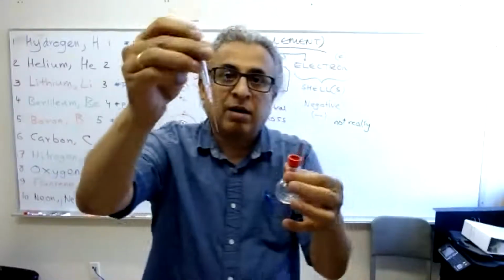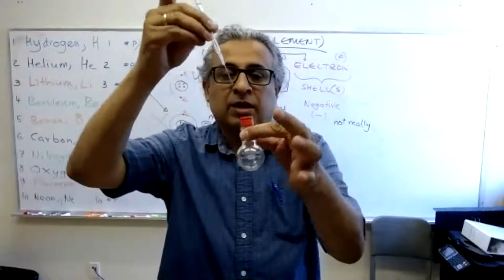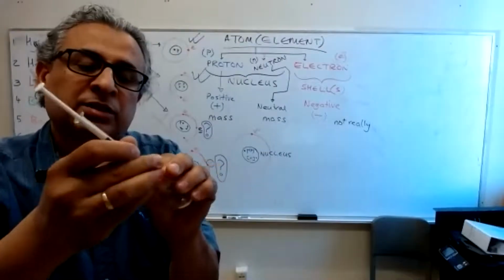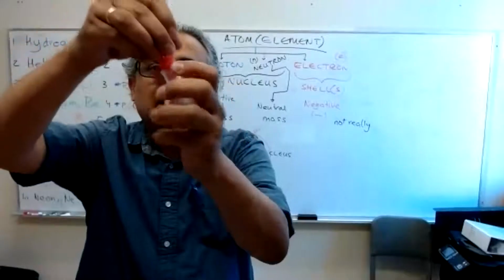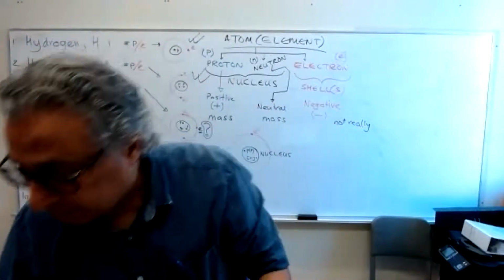And if you're adding 0.5 milliliter of something into a running reaction, you can have a setup like this, and you can insert the needle through this rubber septum, okay? And then you can add it, something like this. Then you pull it out without disturbing the whole scenario.